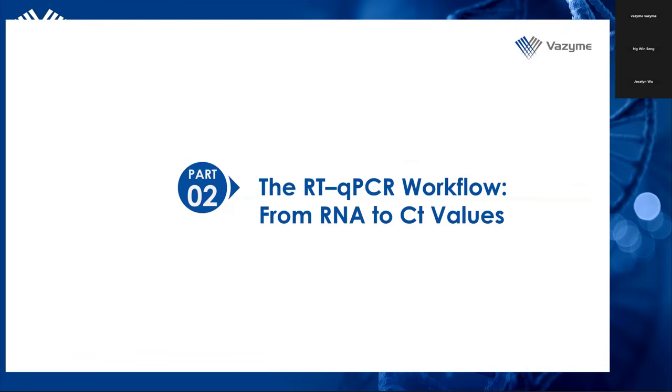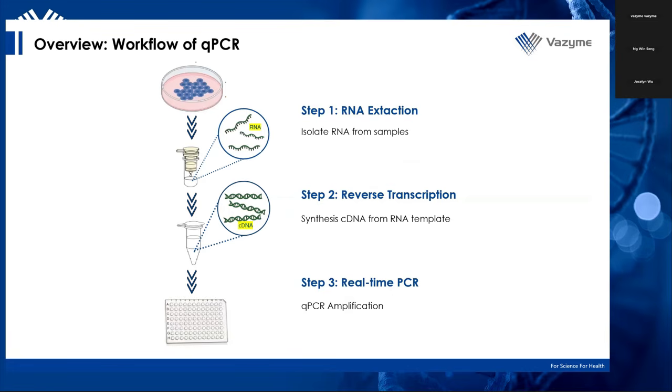Next, let's go to the workflow. The workflow for qPCR is very, very simple. You will start with RNA extraction, where you isolate the RNA from the samples, and then you need to do reverse transcription and turn the RNA into cDNA. cDNA here stands for complementary DNA. Why do we need to do the reverse transcription? Because RNA is very fragile, so it is easily degraded. When you do a reverse transcription into cDNA, it is much more stable.